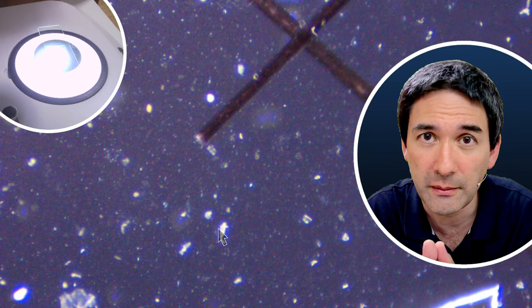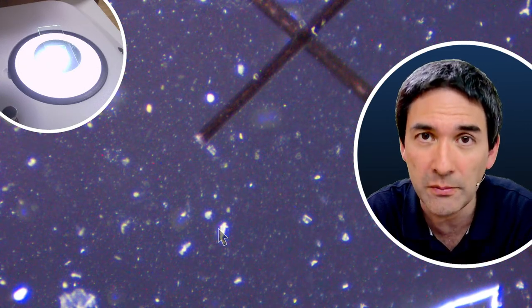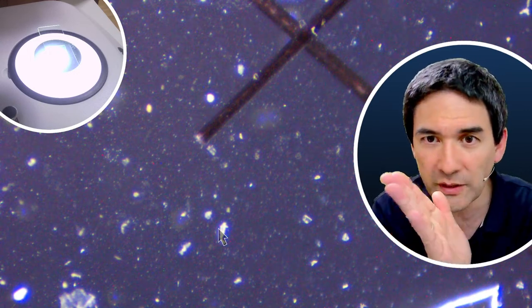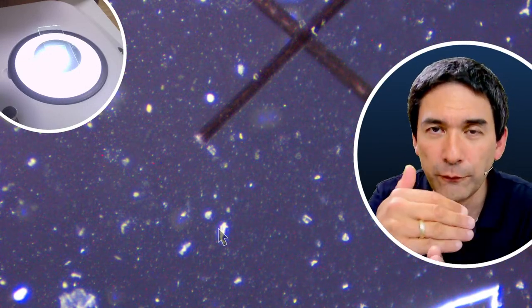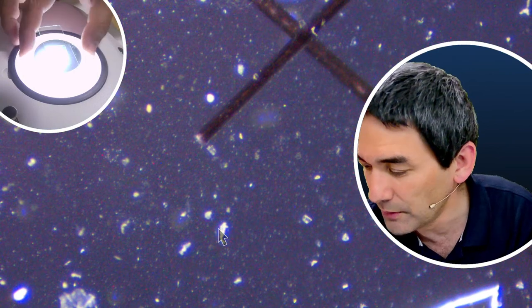But if you have a very thin crystal of vitamin C, which has a so-called chiral C atom, then it will rotate the polarized light a certain degree. It will rotate the different wavelengths differently, and therefore the different colors are cancelled out differently by the analyzing filter, and for this reason you get the colors. Okay, so this is a little bit the way that this works. So yeah, this was my hair.